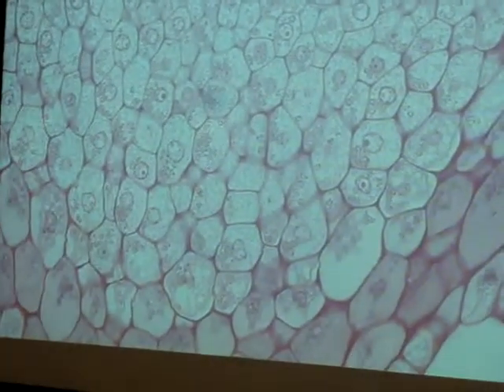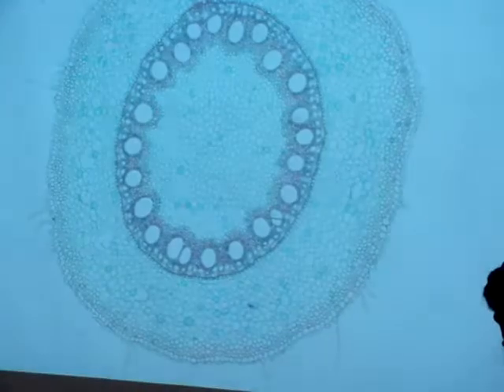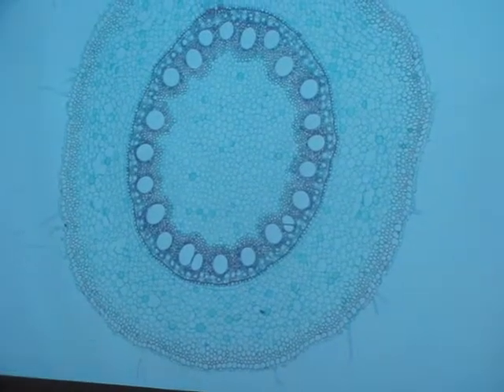Here, this is trying to show you that. That's the meristem, that's the cap. What are those? So what region are you in? Maturation is where your root hairs are. You guys with me? So you're at maturation. As you can see, the root hairs.